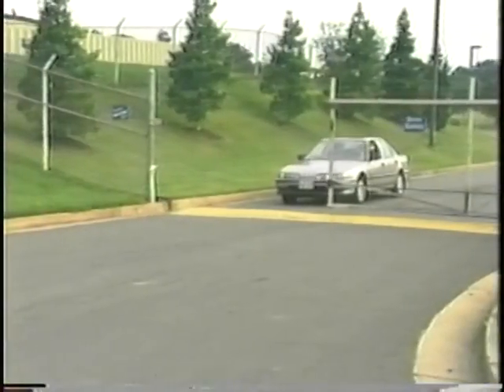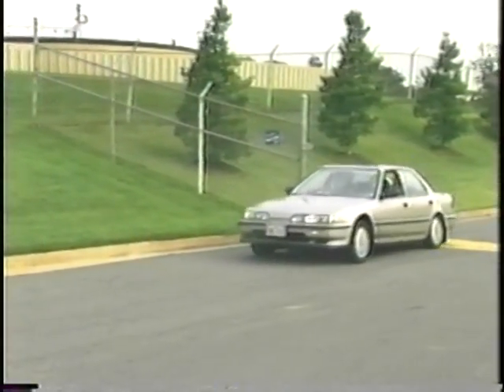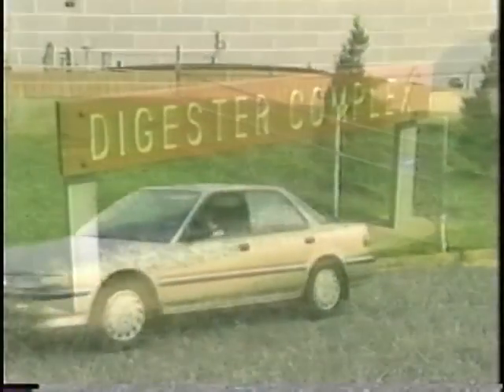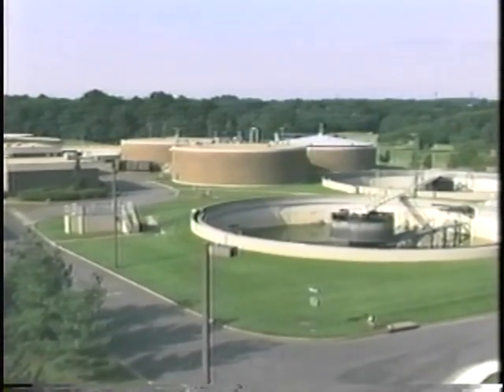Samples must be chilled to 4 degrees centigrade until they are analyzed. Finally, you are ready to go collect samples. Let's start by taking a sample from a digester. Digesters generate a liquid sludge that typically ranges from 0.5 to 4% solids.